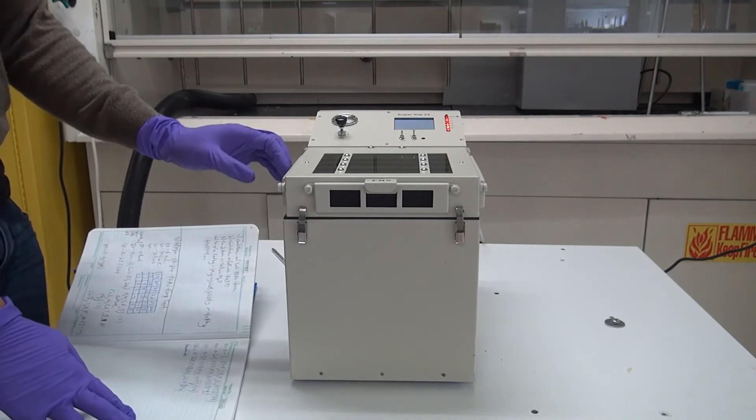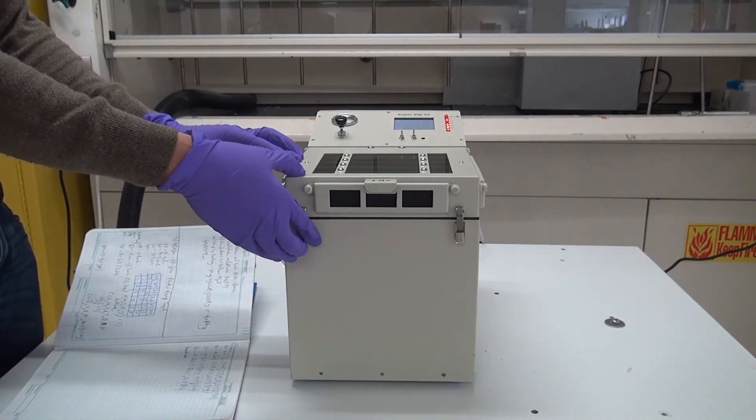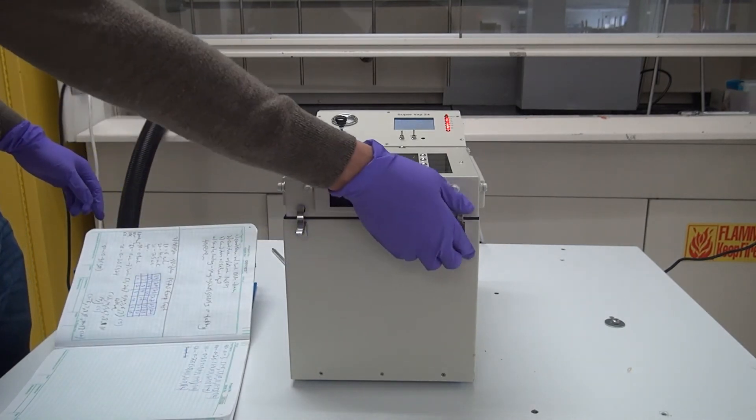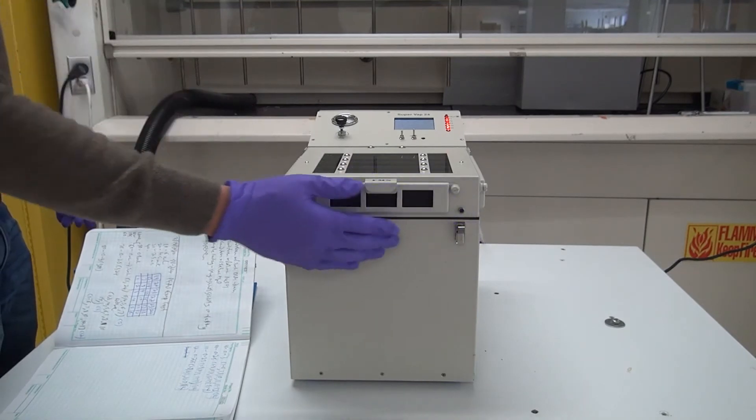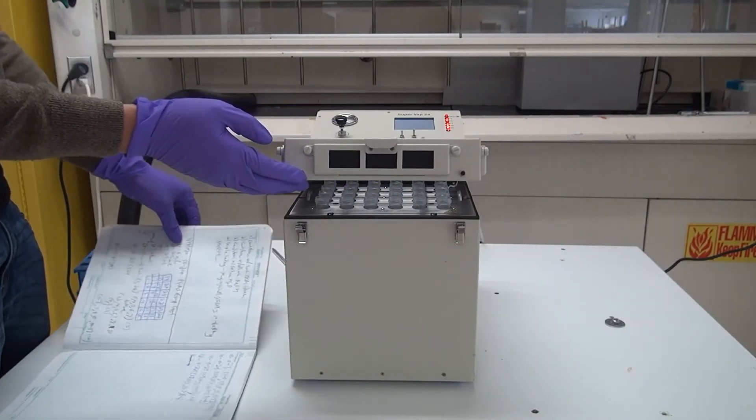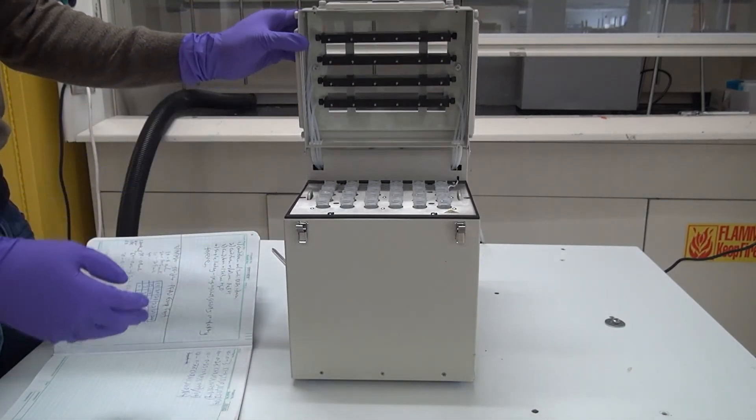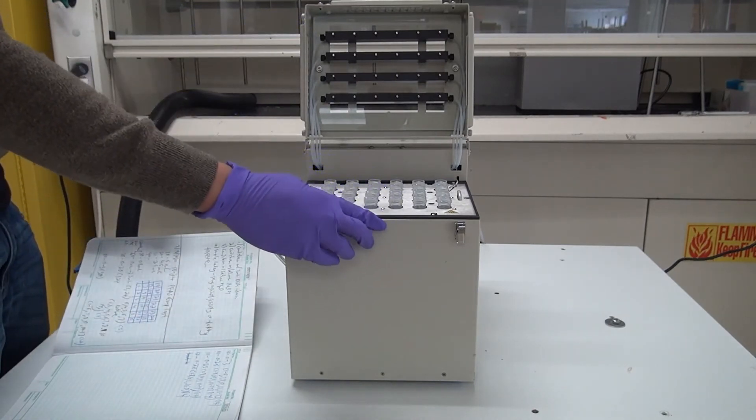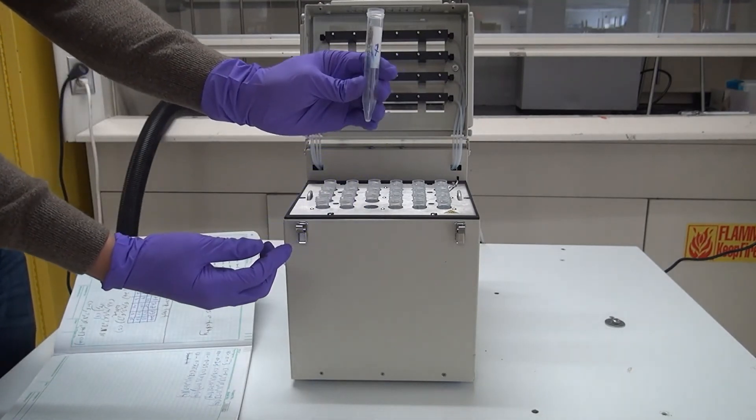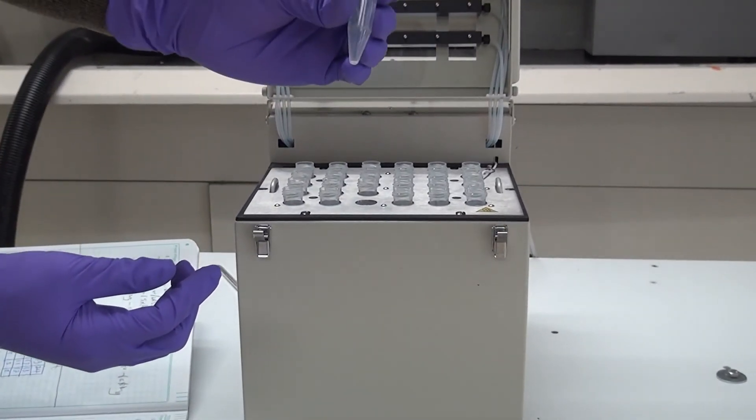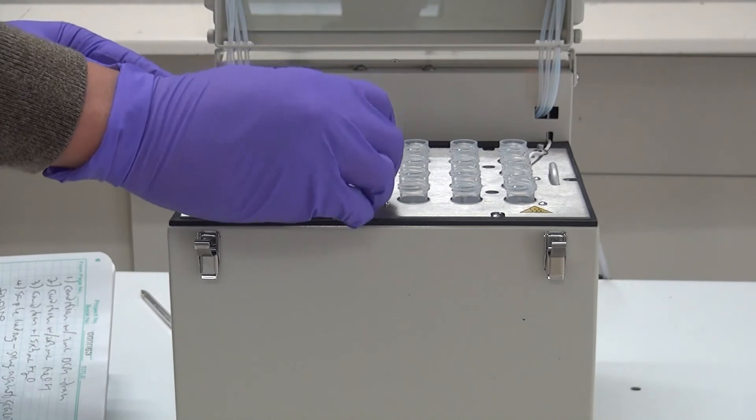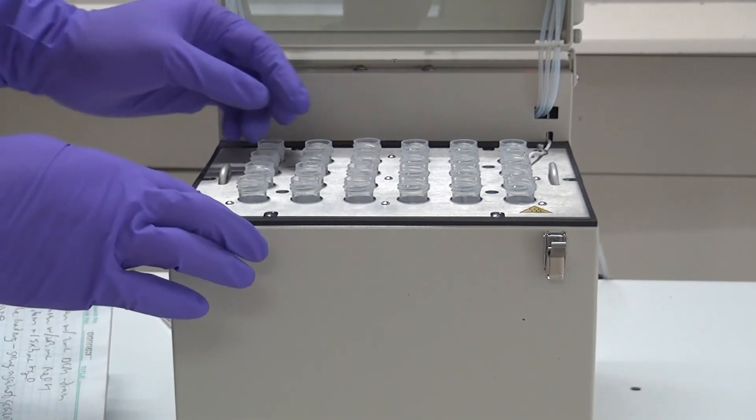Okay so it's 70 minutes and the vast majority of these are all finished. Somewhere finished around 60 minutes but we decided to just let it continue on for the sake of keeping the video short and we'll show you some of those right now. So we pull a vial out and as you can see that's dry. Lower that a little bit please, a little bit lower.